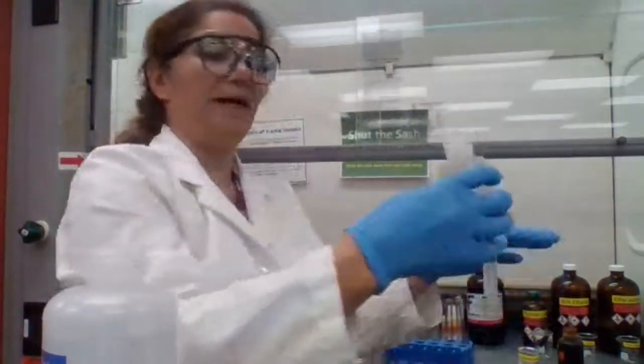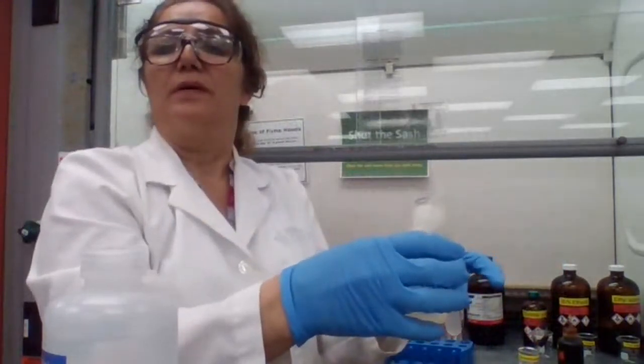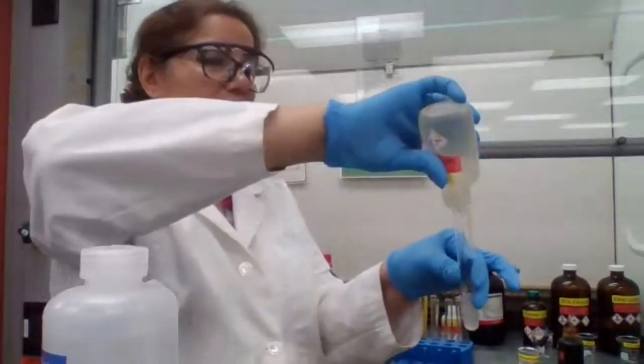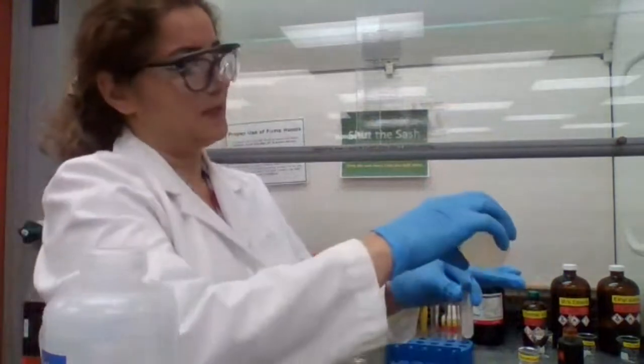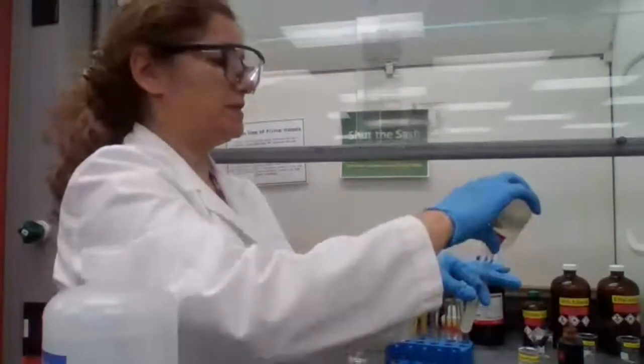Going to add sodium hydroxide, since it's the same experiment. I'm just repeating the same steps. I add 10% sodium hydroxide to make the solution basic.